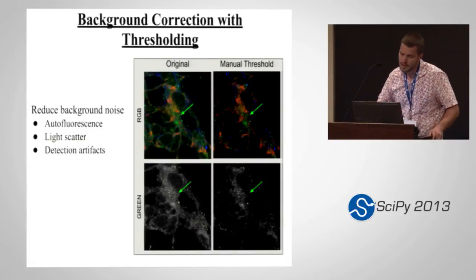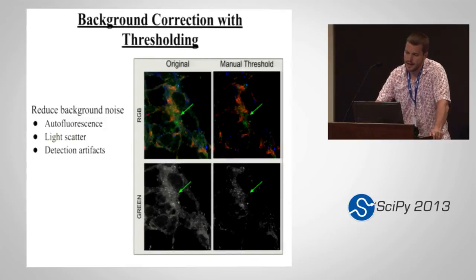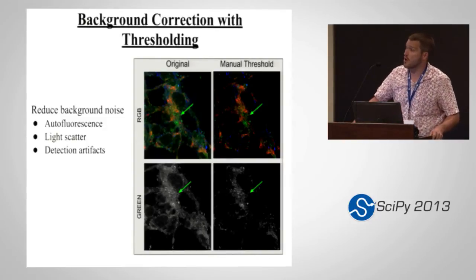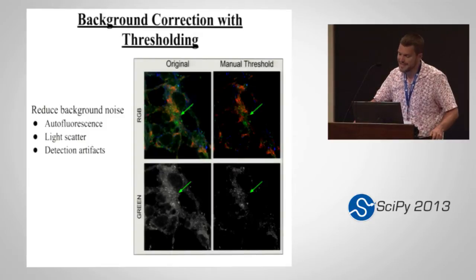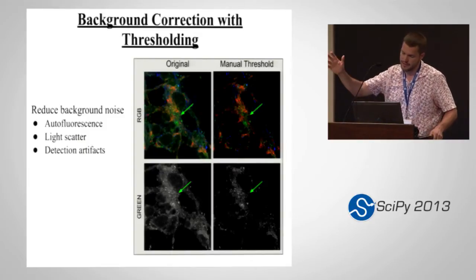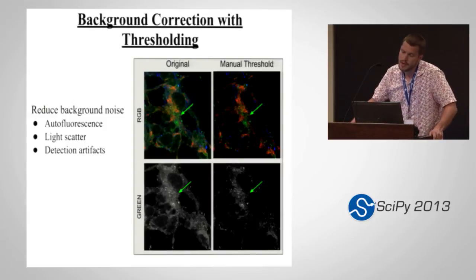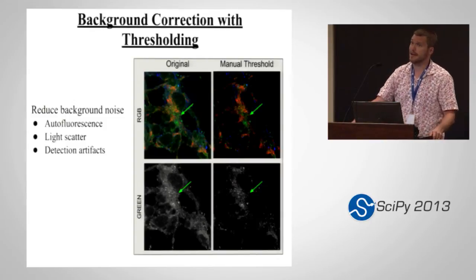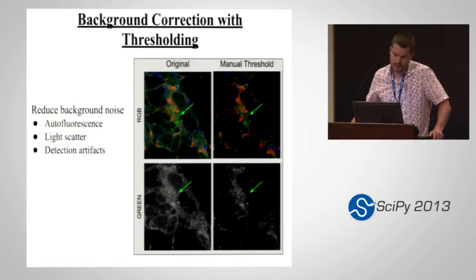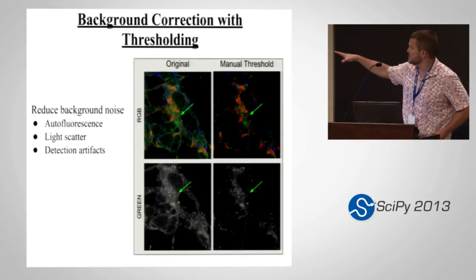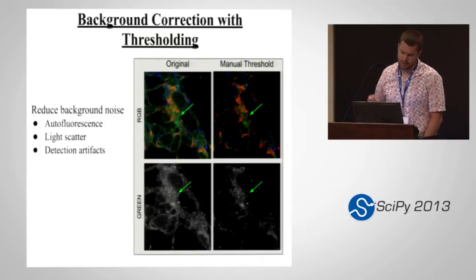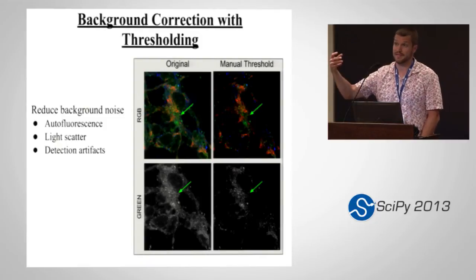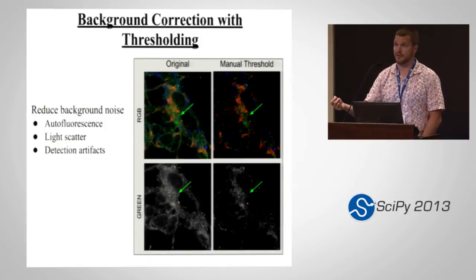Thresholding is done on a channel-by-channel basis. On the left you see the original raw images, and to the right you see images after they've been thresholded by our expert — the other part of our dynamic duo. Some typical sources of background noise in confocal microscopy come from autofluorescence, scatter, and experimental detection artifacts. The lower set of images is the green channel, and that's particularly important because autofluorescence — light coming back from the cellular sample itself — is maximized in the green channel.